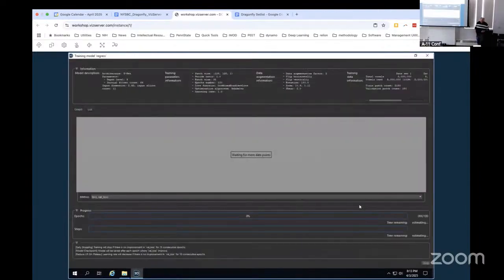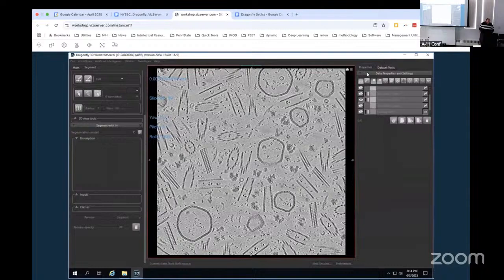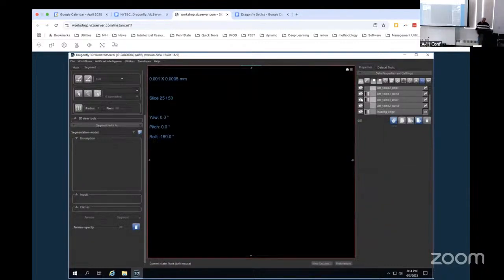But I have this network trained. We don't need to train it. We can just apply it. I just thought I'd hit train for the heck of it. We'll stop it. Now, let's do the denoise button. I missed that first. We didn't denoise yet.